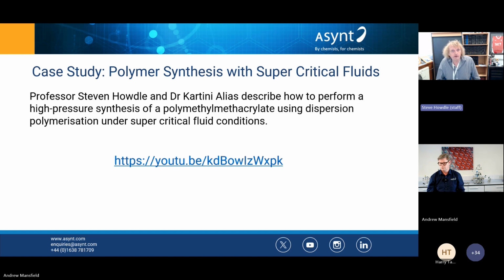And there are vessels that are around about 25,000 litres in size. So the scale can be really quite high. And similarly, there are plants around the world that do decaffeination of coffee and cleaning up foodstuffs. So supercritical fluid vessels are everywhere and very popular and commercially viable. But my interest was in creating small scale equipment that we could work with.